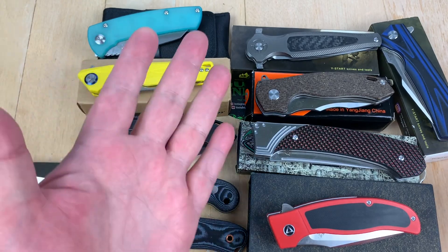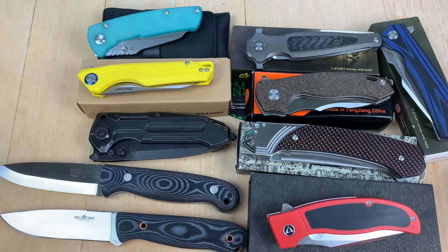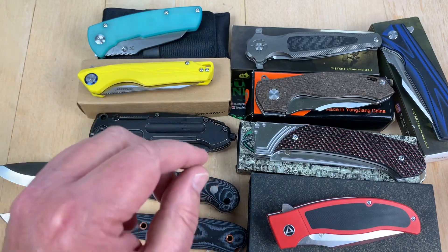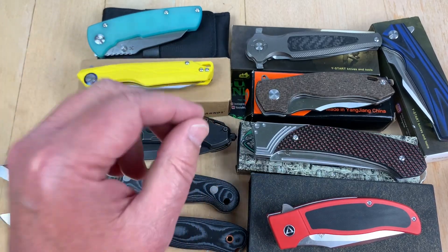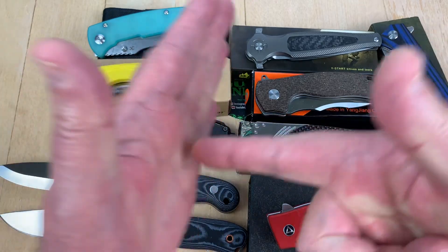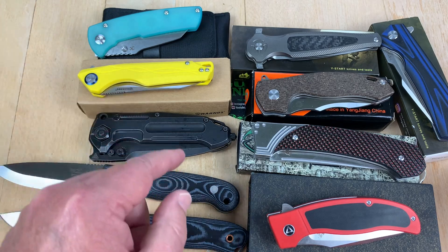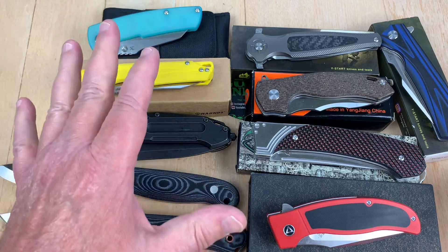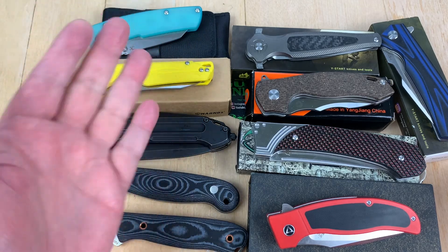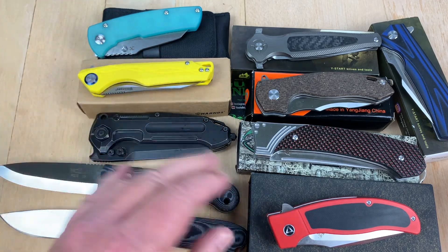We've got Batch 43 knife test blade composition results. This is not a cutting test, this is not edge retention testing. This is where we take an XRF analyzer gun — or PMI gun — and shoot X-rays at the steel blade, and it returns the actual elemental composition of the steel so we can figure out what it is and if it is as advertised. We've got 10 knives in today's batch.